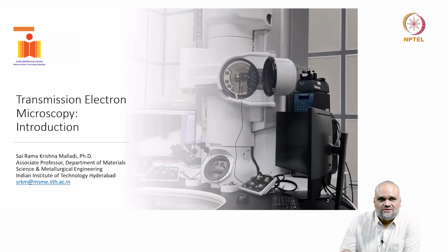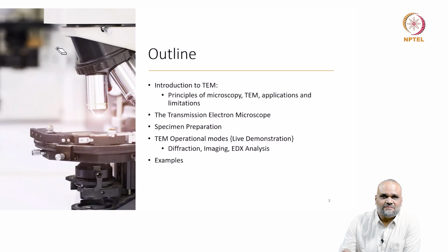Now, why do we need to do this microscopy? If I'm preparing some kind of a material and I want to know during the processing how the material's properties change, or how the internal structure of the material changes, and eventually how the material properties change, I need to establish some kind of a relationship between the material and the processes that have gone through. And this link is typically established by using some kind of a characterization tool.